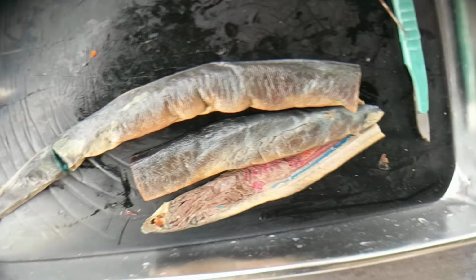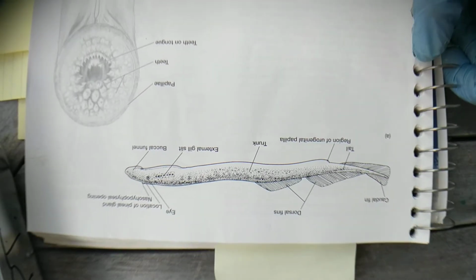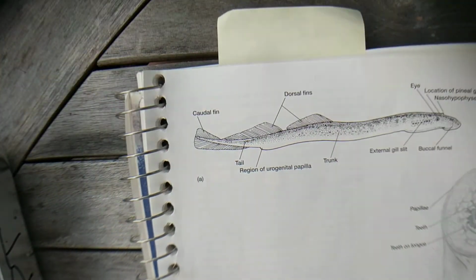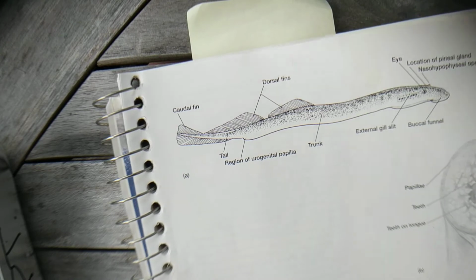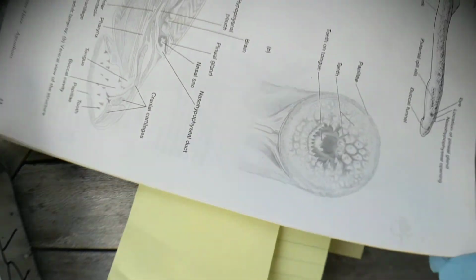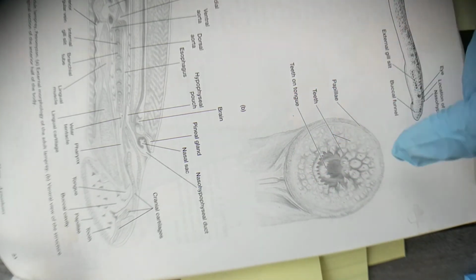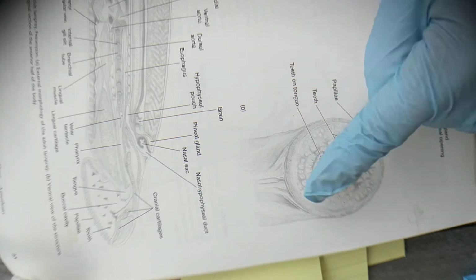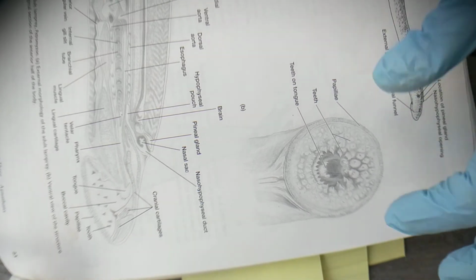So I'm just going to pull over the lab book so you can see all these features that I showed you. Here are the external features, so just to have it on the recording. Caudal fin and everything. Here's the papilla. This is a very large lamprey where the mouth is very open. Ours was kind of squished closed, but that's the opening, and you can see how they could grab on to fish and attach with a suction.